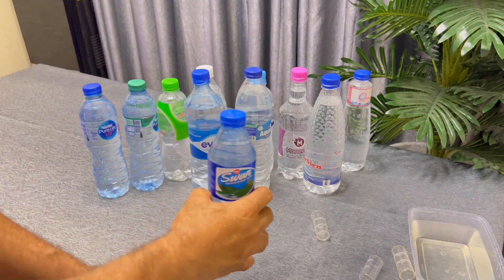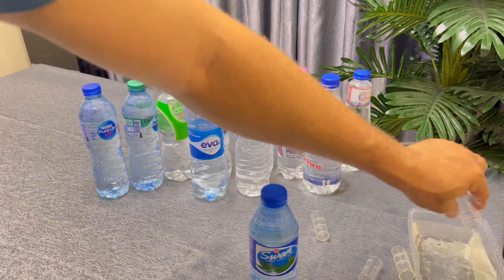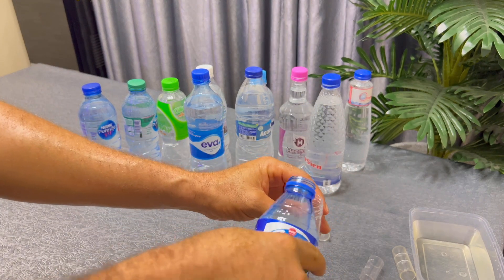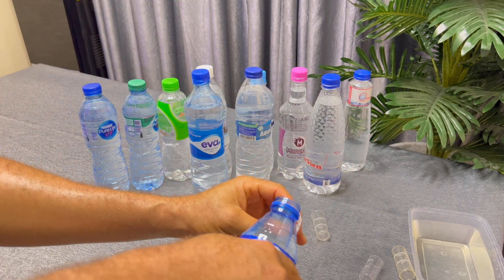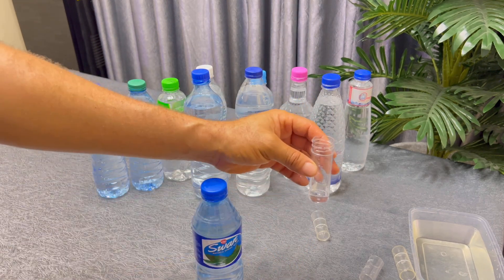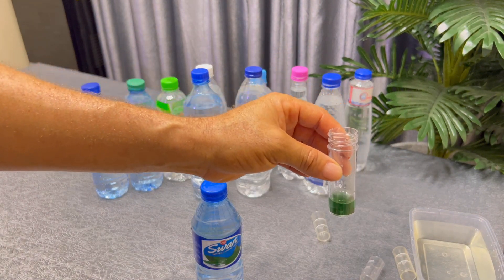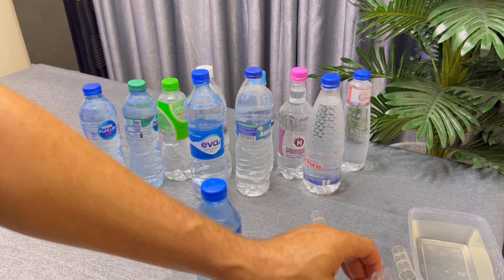Then we have Swan water — last but not the least. I rinse the test tube with it and then drop five millilitres of Swan into the test tube for the test. We drop two drops of the tester into the test tube. This is what we got — pH 7, normal water, good for drinking.